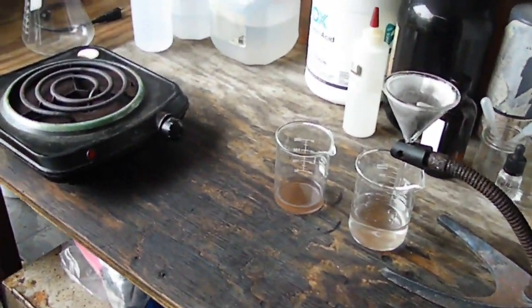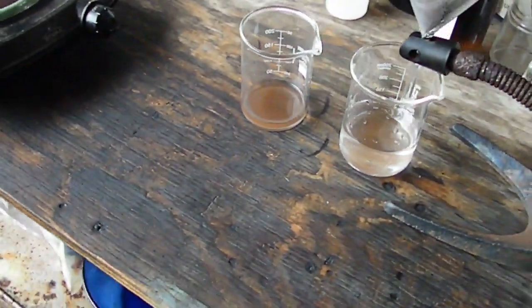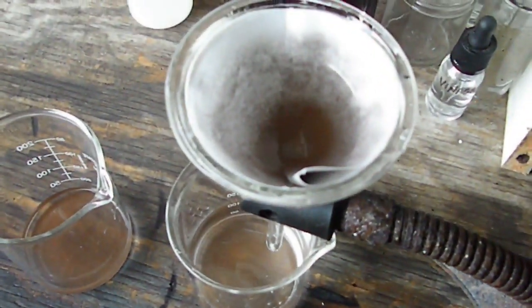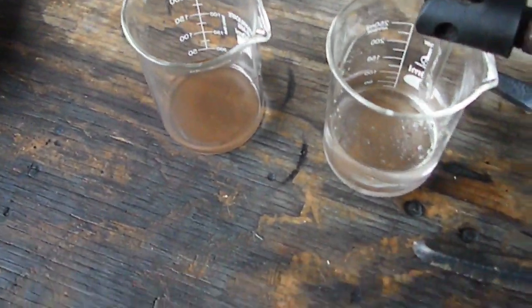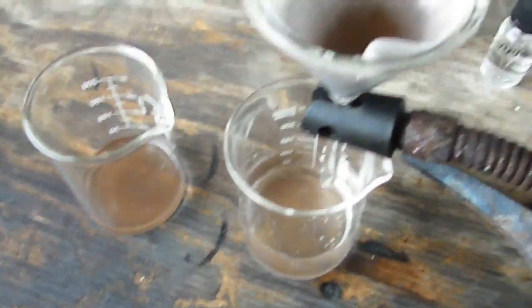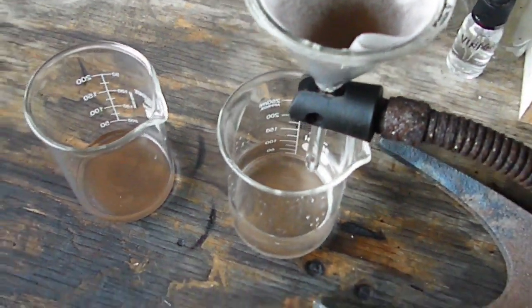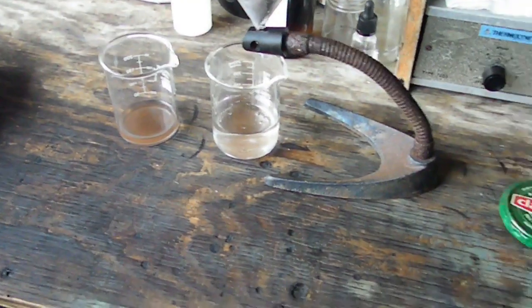Hey everybody, Backyard Scrappin' here, and welcome to part three of New Preppers Refine. I'm actually filtering off the powder from the BGA chips. This is a slow filter paper. As you can see, we did get a drop, but it was very, very fine powder.